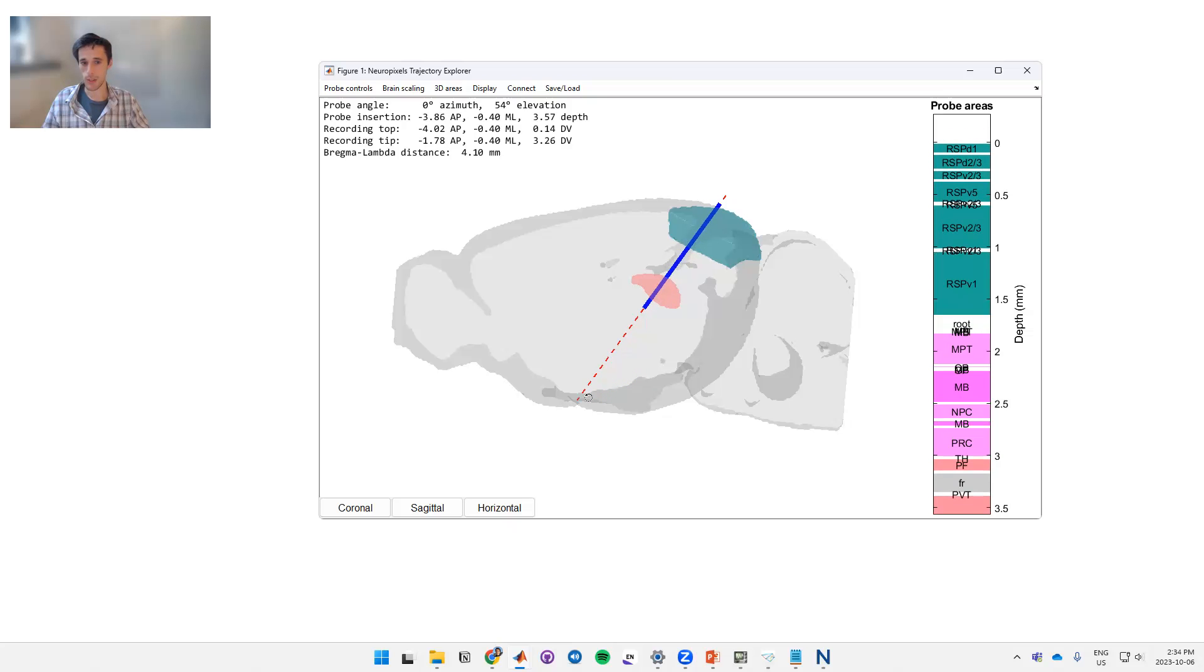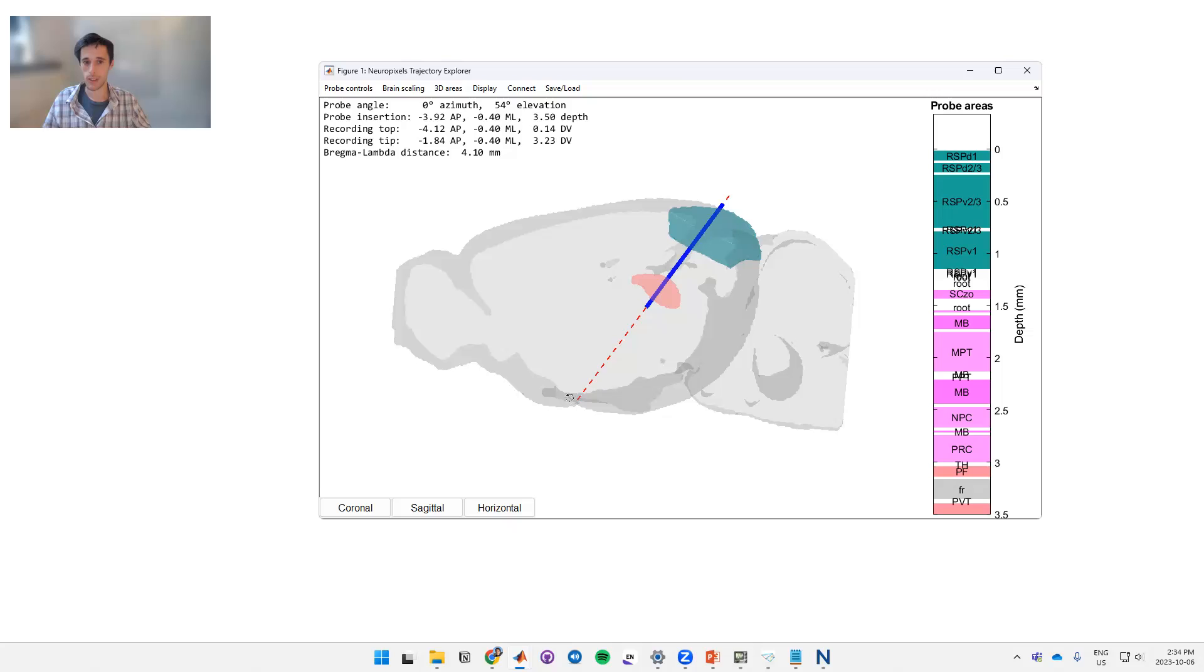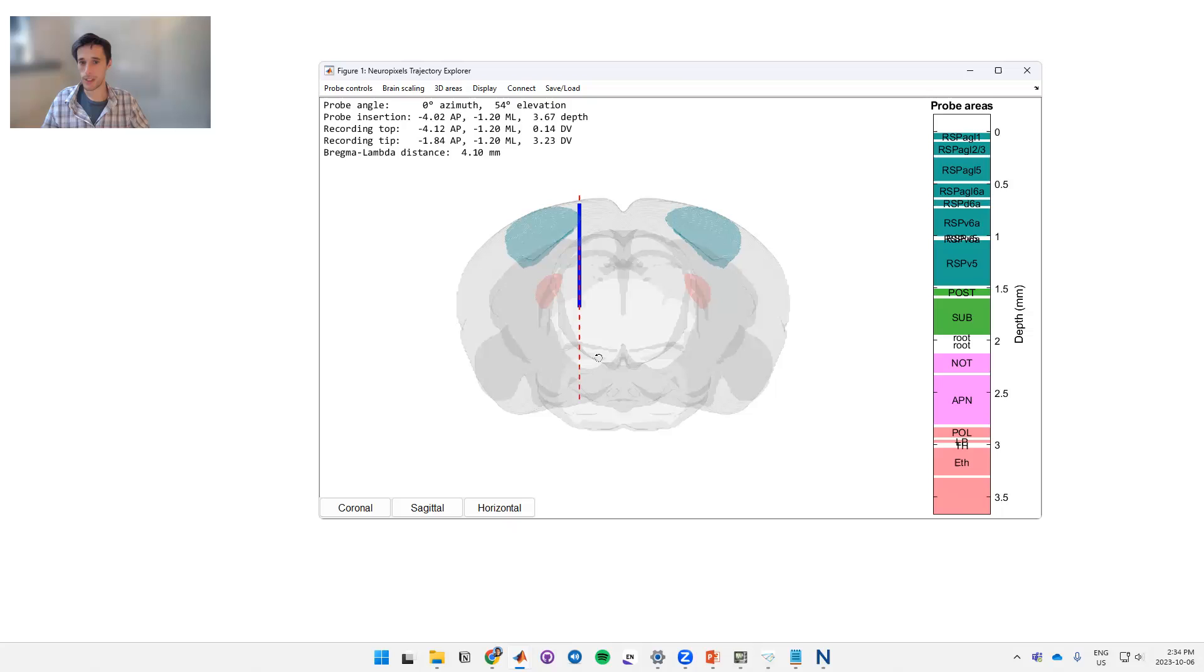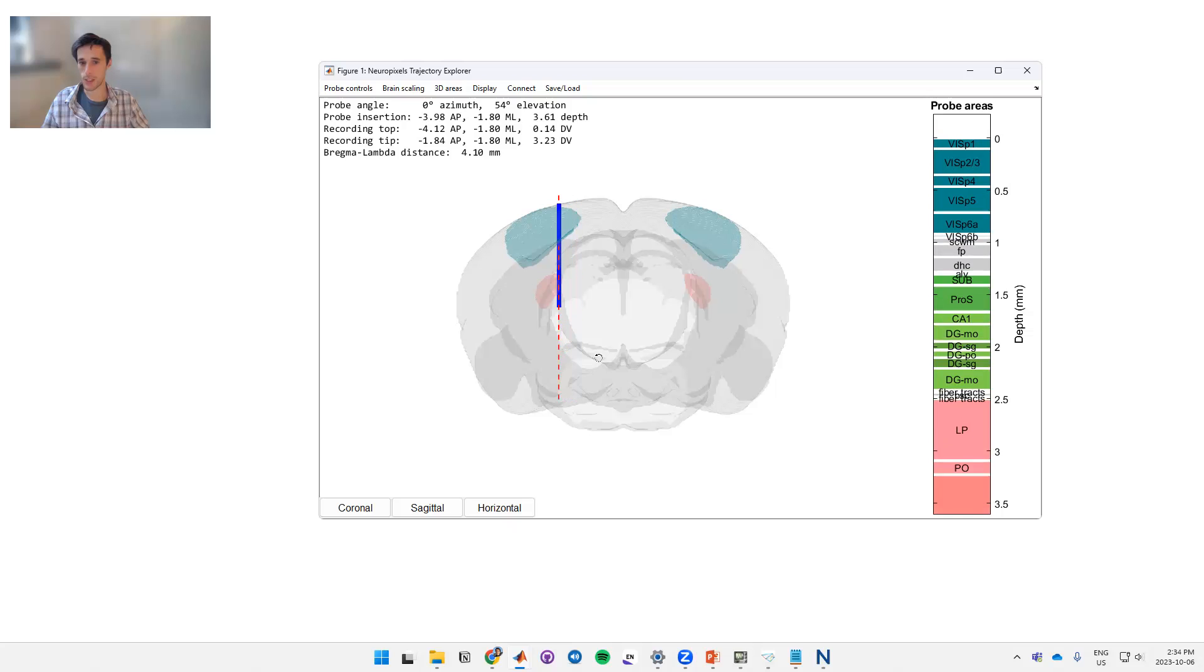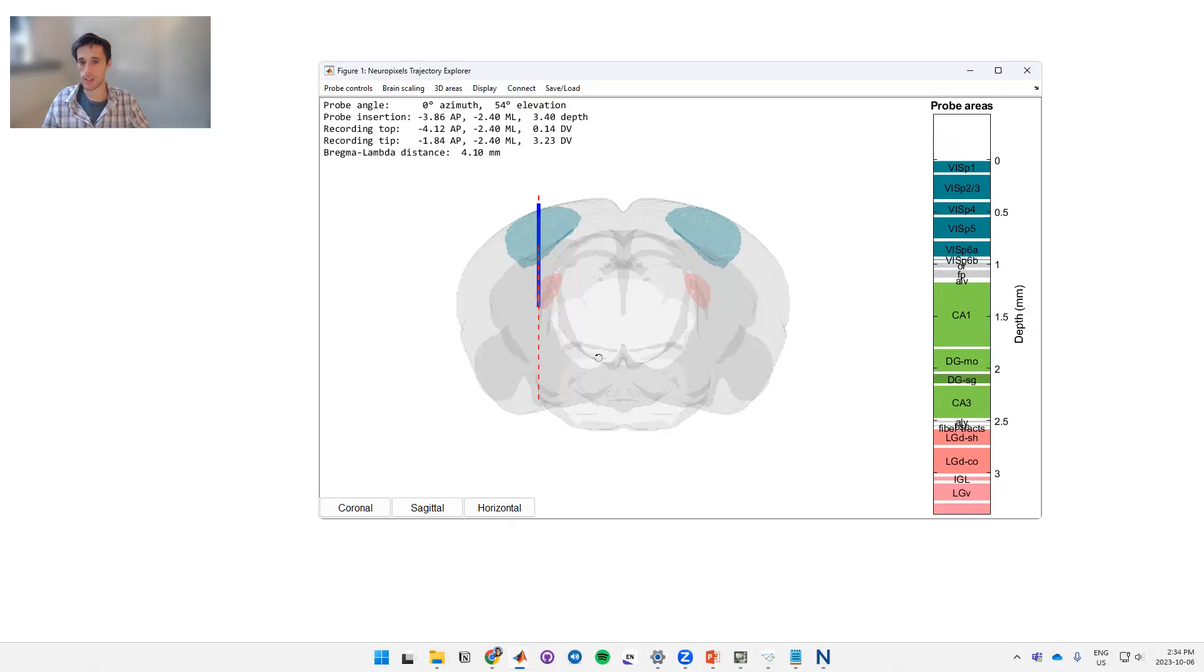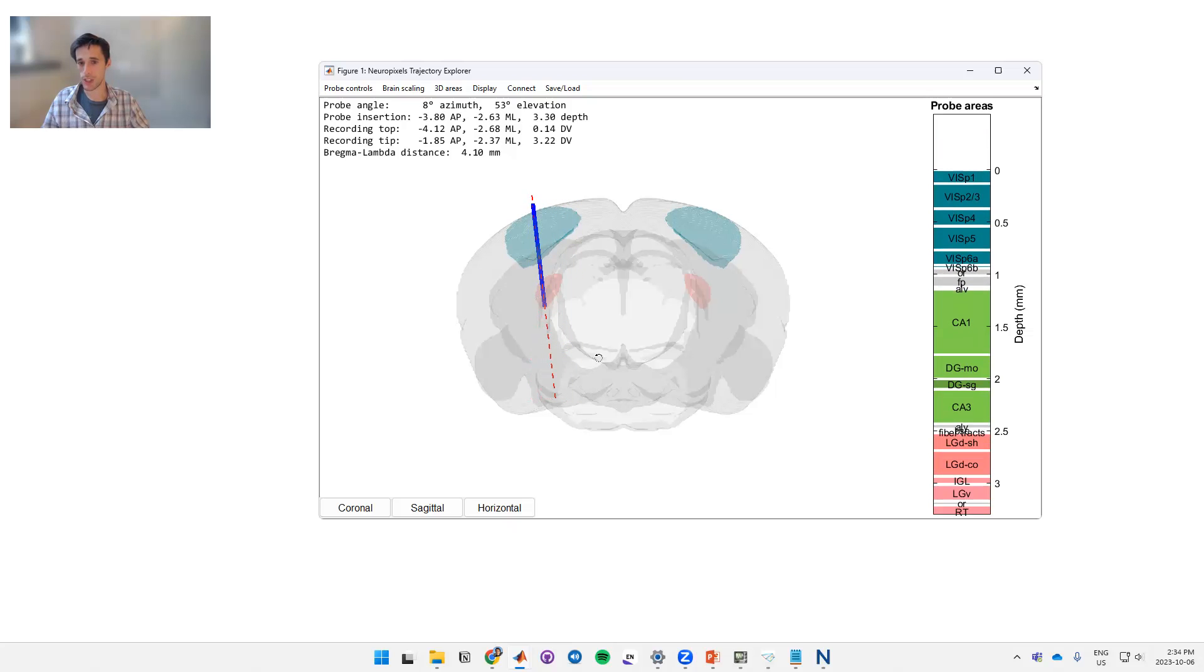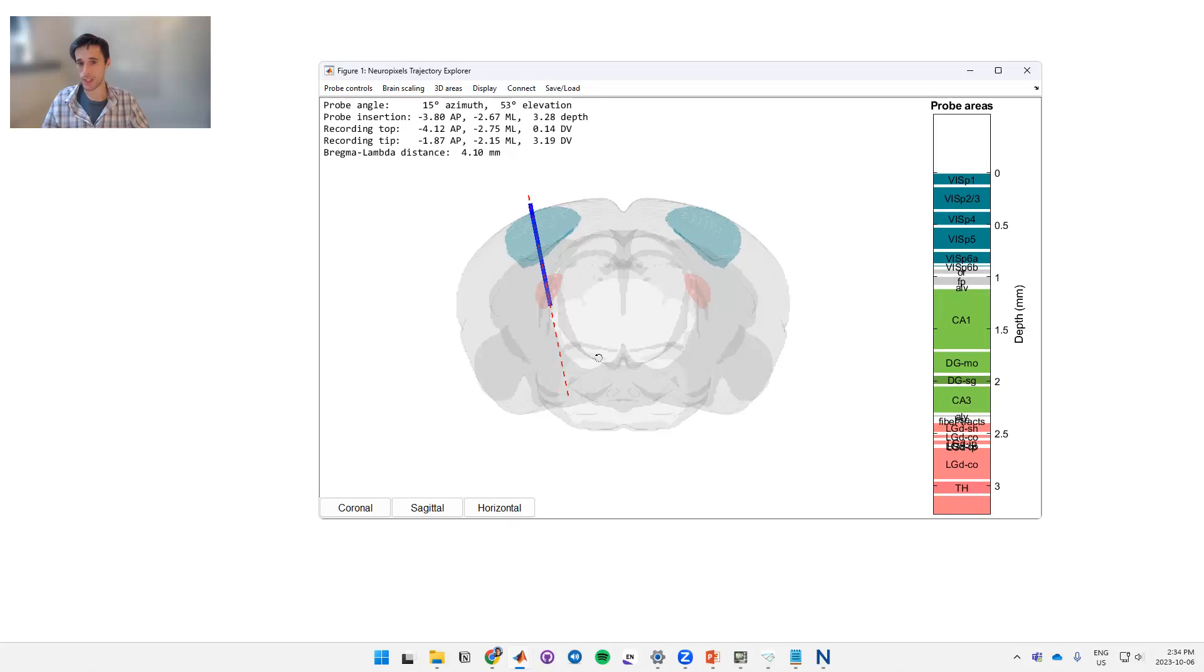So let's say we like that as our general sagittal trajectory. Now we can flip our view to coronal and bring this left until it intersects with these structures. And again we can hold shift and press right to change the angle until we're happy that it's going through both of these things.